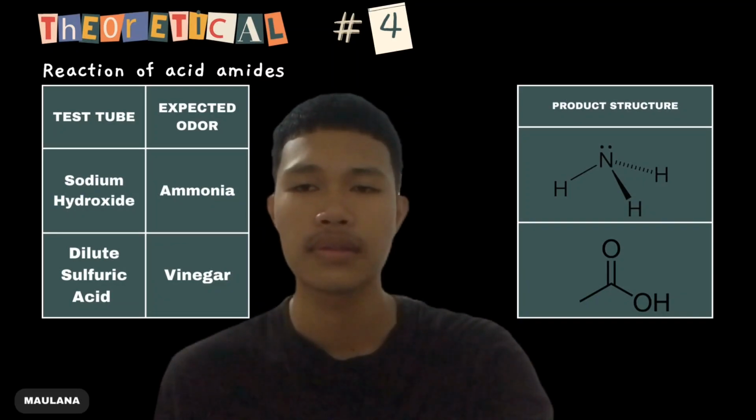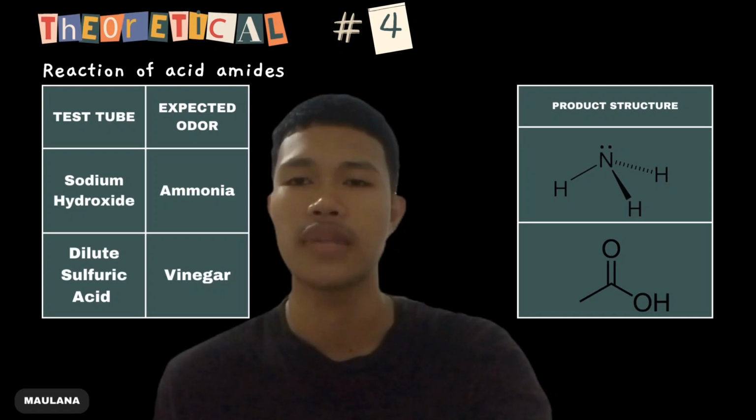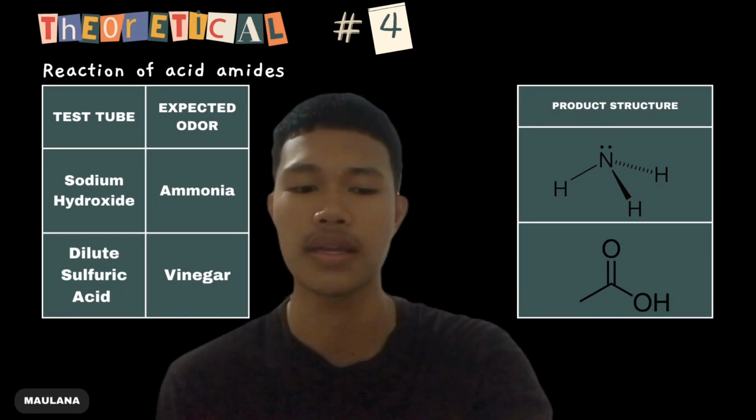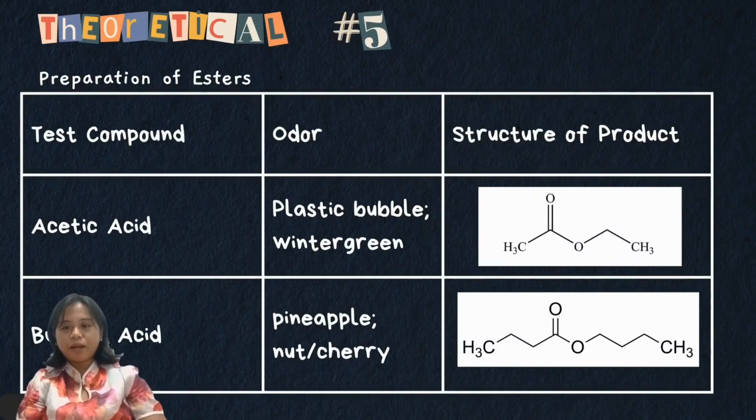Next, when heated with an acid like dilute sulfuric acid, acetamide also undergoes hydrolysis. The amide bond breaks and forms acetic acid, which has a vinegar-like odor.